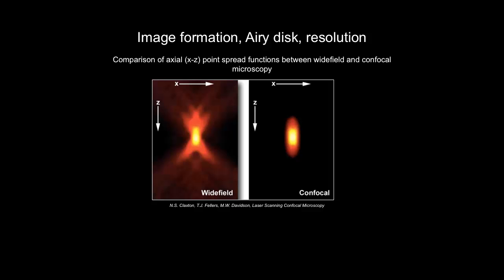Now the improvement in the resolution for the confocal is not an extraordinary improvement, lateral and axial, but what really matters for the confocal is the capability of the technique to do optical sectioning, and that really improves the effective Z resolution.